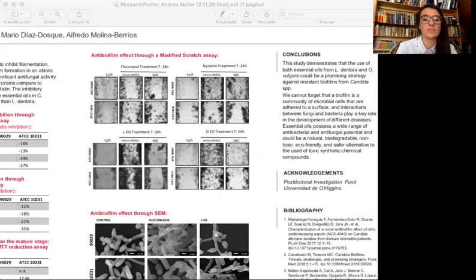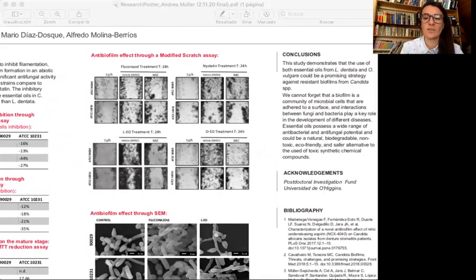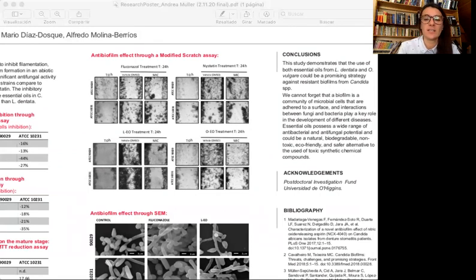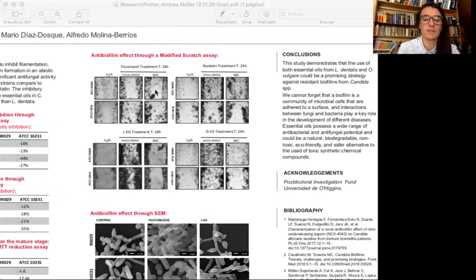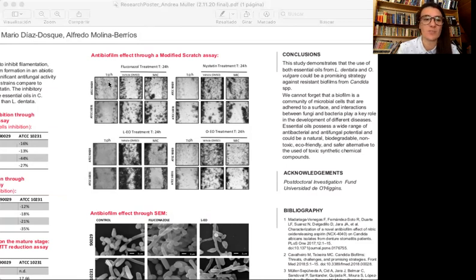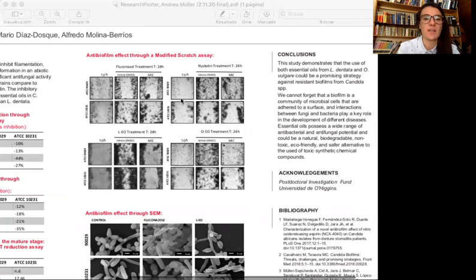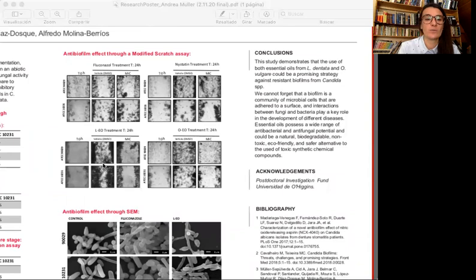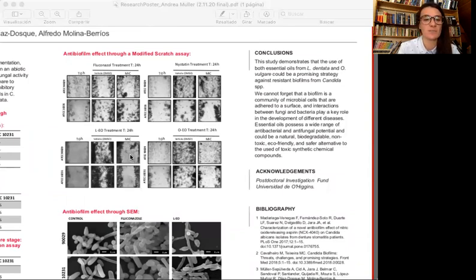The results observed on the modified scratch assay showed that the use of fluconazole and nystatin did not inhibit the formation of new biofilms. Here we see that at 24 hours post-scratch, there is no difference with fluconazole and nystatin in the biofilm formation, whereas the use of oregano and lavender essential oils inhibits its formation. There is no new biofilm formation.